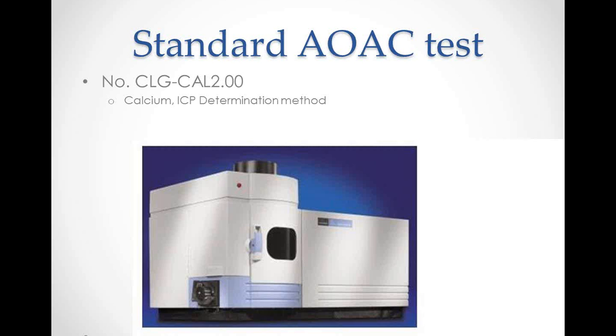This process relies on the solubilization of calcium into a calcium ion using acid digestion. But like any acid digestion process, a number of hazardous solvents, including but not limited to hydrochloric acid and nitric acid, as well as heat, typically with a hot plate, must be used. This not only creates a dangerous lab environment for the technicians running the test, but it also creates a costly operation, as a large-scale ICP, digestion plate, stirrer, chemicals, and all of the proper filtration papers are needed for every single analysis. And mostly due to this exhausting sample prep process of digestion, it's a long test, taking sometimes up to an hour for one single sample to be run.